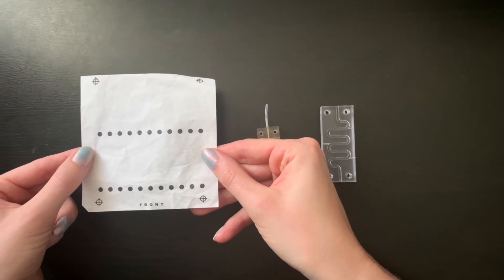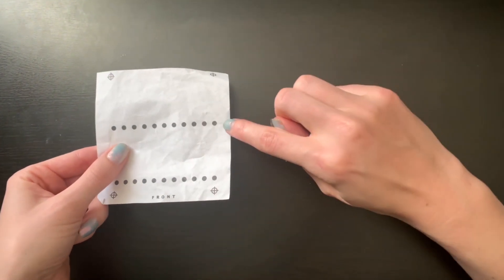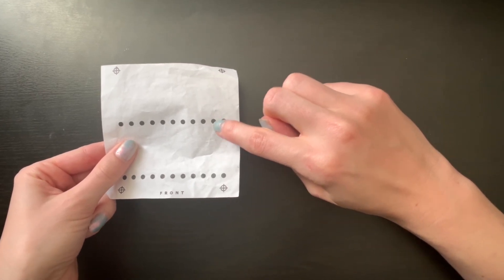Here you see a sheet of our sensors — this is just normal paper, so it's nice and flexible. Every single black dot is a sensor, so all the material is contained in the black dot. Now if we shine UV light onto these black dots, the material will light up, just like you can see here.